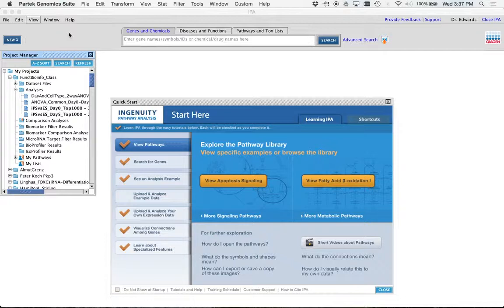That means this isn't some kind of algorithm that puts all this stuff together. Most of the freeware bioinformatic packages are about text mining. This actually has a human individual going through the data, going to the papers and saying, yes, this gene interacts with this gene in this paper. All that information is tied.